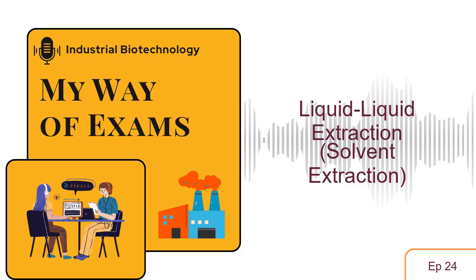So if it's pulling more, that means it's more efficient. Exactly. And even tiny differences in this KD can become huge when you're doing extraction multiple times, repeat, repeat, repeat. So it's about finding a solvent that your product really prefers way more than all the junk you don't want. That's the whole game. Selectivity. If your target compound has a much better KD than all the impurities, that's when you get a clean separation.